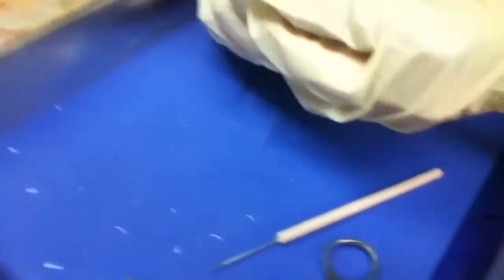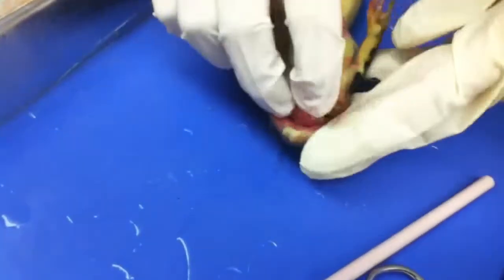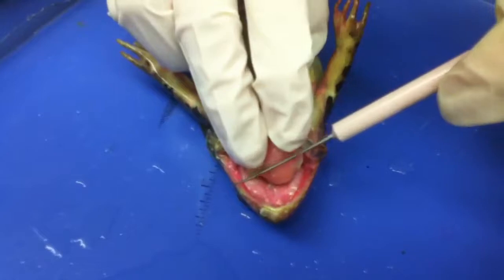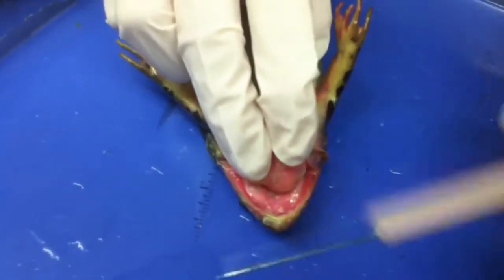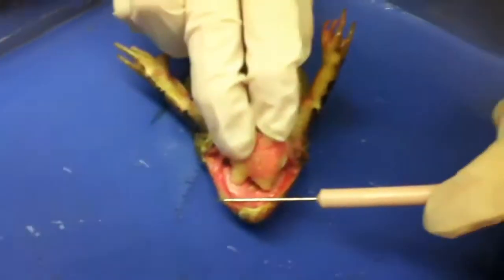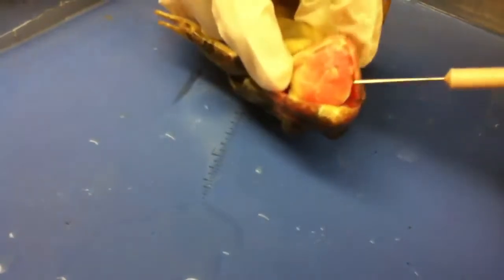Okay. Here's the inside of the mouth. To locate and identify the structures inside the mouth, use the dual probe to help find them. Look, there's his teeth. Right there. Here's his inside teeth. Here's his outside teeth. You can see them. You can feel it. Yeah, you can see the tongue. Here's his tongue, and it's really weird.